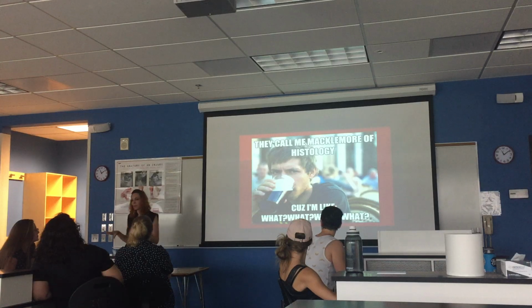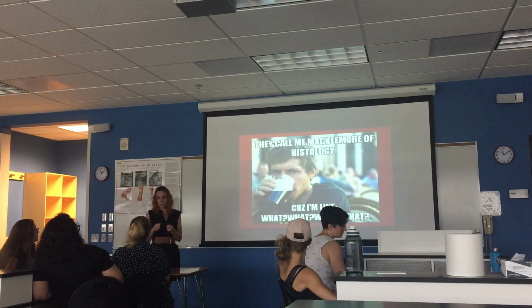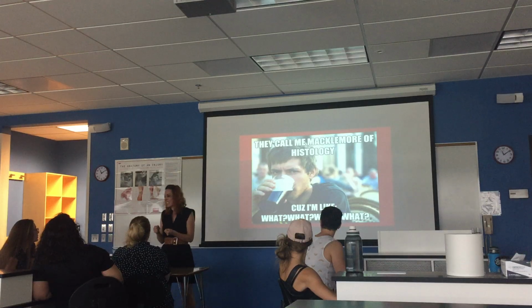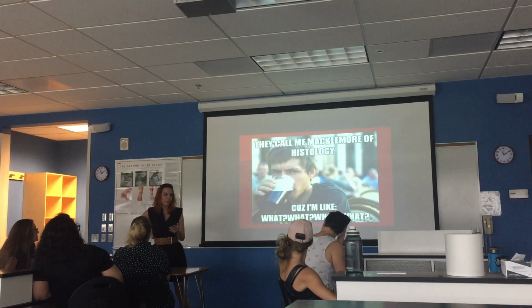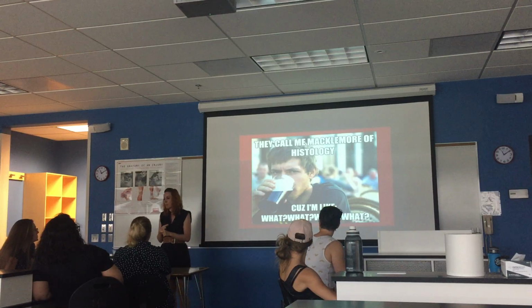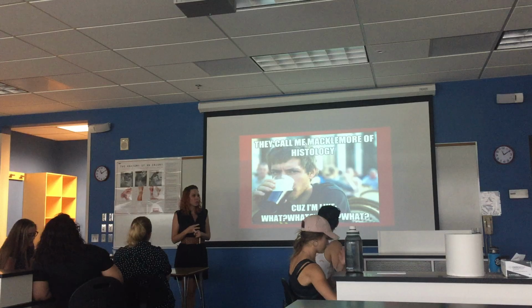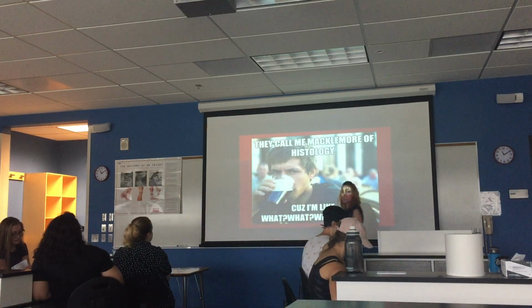So this is just my disclaimer saying it's okay if you're frustrated for the first little pass with this, because it takes a little bit. Even if you're comfortable using the microscope and focusing it, it does take a little bit to start to orient yourself with what you are actually looking at, what you are looking for. So I have built this lab to have like 2 or 3 full sessions where we will be looking at this, and then you can also be studying this at home, looking at your textbook.